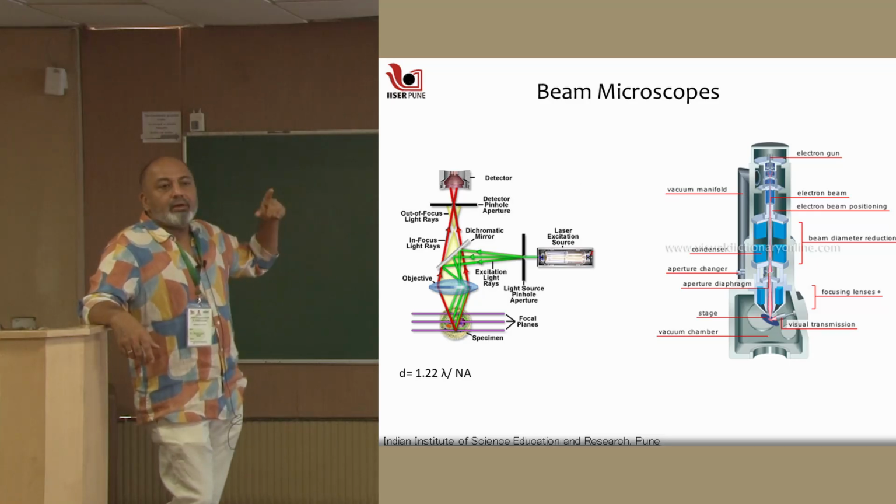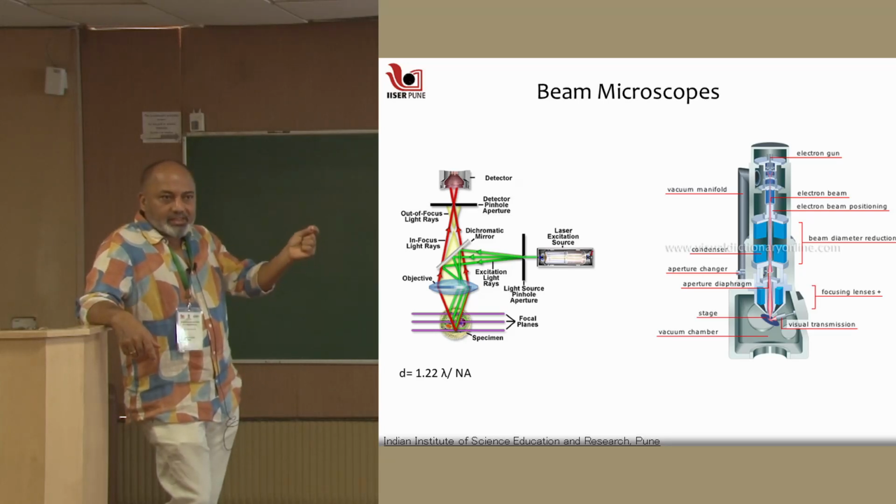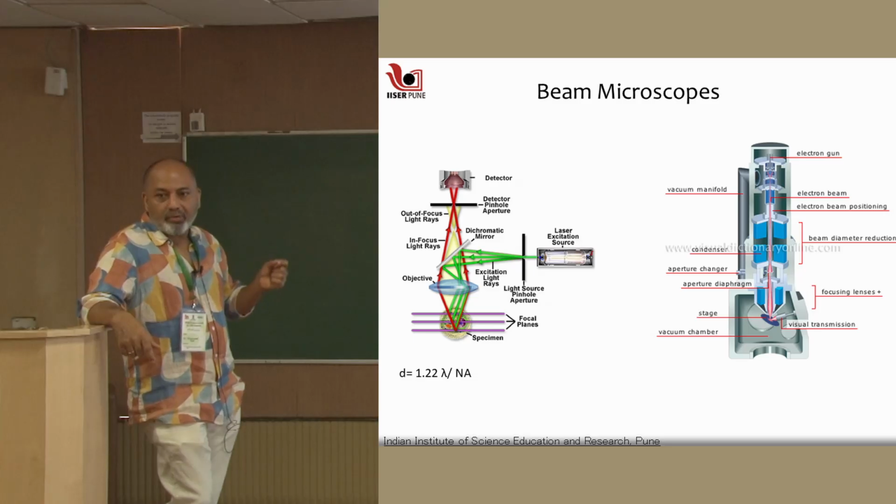There, if you use an electron beam and increase its energy, its wavelength can go down. This is what quantum mechanics told us, right? The de Broglie hypothesis, that the wavelength is determined by the kinetic energy that the electrons have, and the faster the electron is moving, the tighter its localization is, and it is giving you a smaller wavelength.